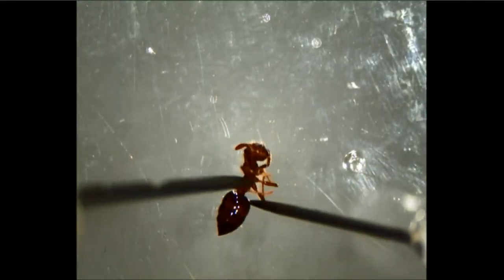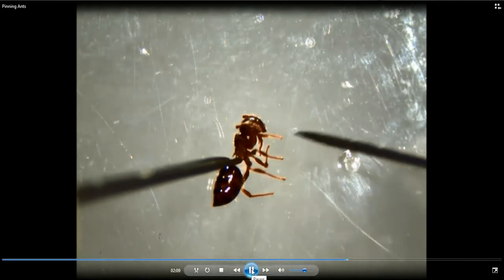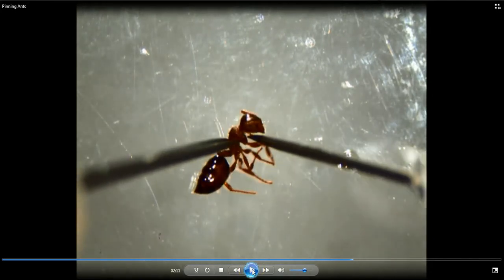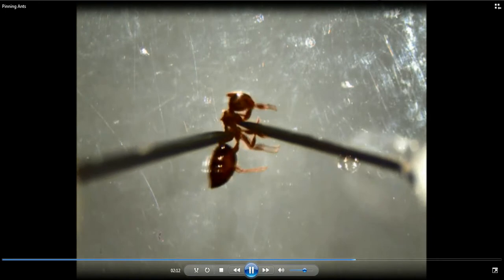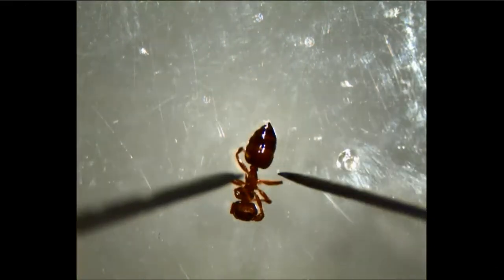This is another ant — a smaller Crematogaster. What I want to show you here is a different tool. This is actually a regular microprobe, and here you can see a little probe that's actually two insect pins hot glued together, so that you can get on either side of the ant. It really helps hold. This is available to you in the lab too. So get your little Crematogaster acrobat ant here.